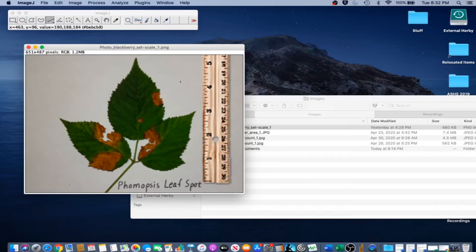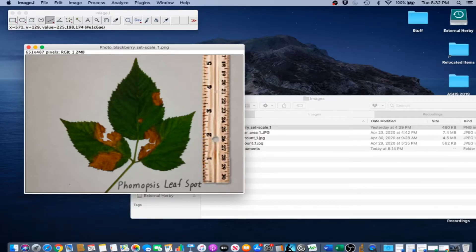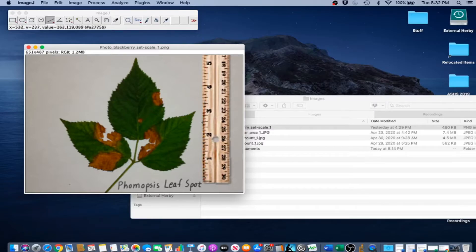Include a reference object of known size in the image, like the ruler in this image, so the image can be scaled. The reference object used for scaling a photograph should always be large and near the object of interest.